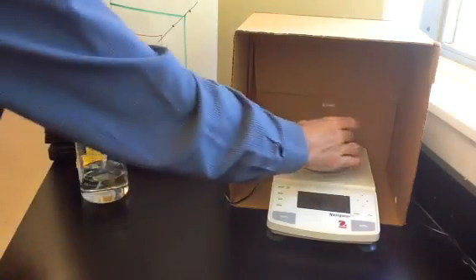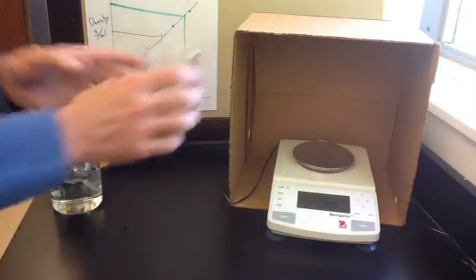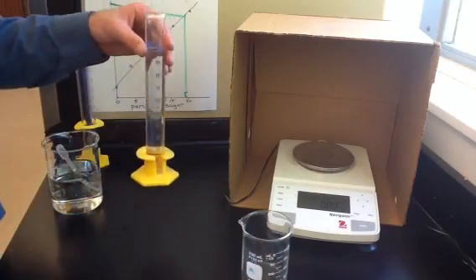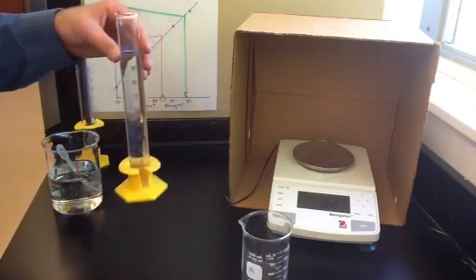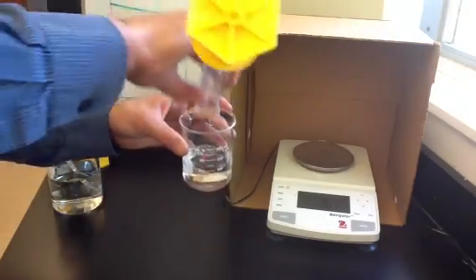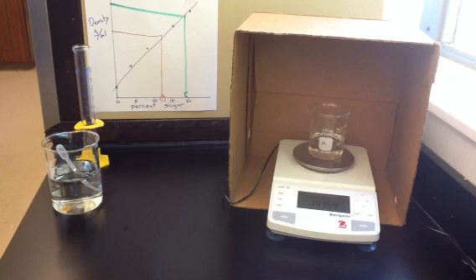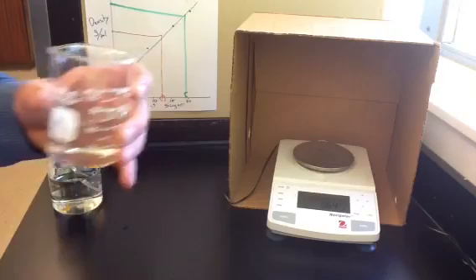All right, and we need to repeat this procedure with the other solutions. So we're going to keep this same beaker, and I've measured out 100 milliliters of a 5% solution. So I had a 5% solution mixed up, and I've already measured out 100 milliliters of it. So we'll just pour that into our beaker. We'll find its mass, 193.54. 193.54 for the 5% sugar solution.